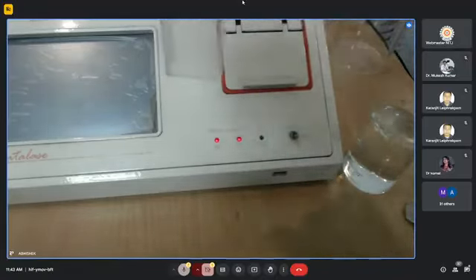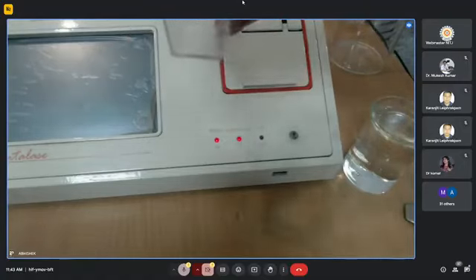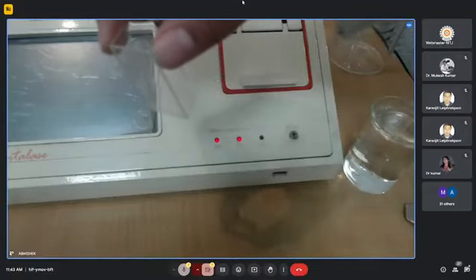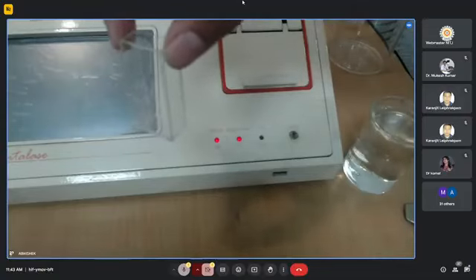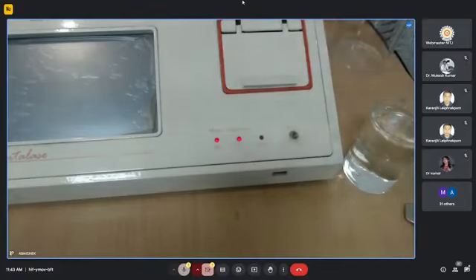And the sample should not have any suspended particles. Groundwater sample or whatever sample we want to measure should not have any kind of suspended particles or impurities which can scatter light and give anomalous results. Every sample having suspended impurity should be filtered with Whatman grade 602 filter paper, which can remove particles of sizes 2 micron or above.